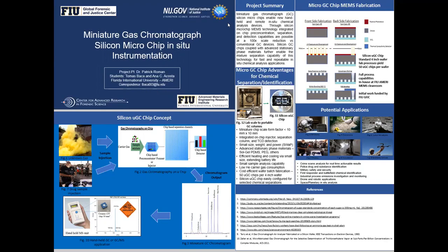We have another question from the chat. What is the mechanism of separation on the chip? So the way the chip essentially works is when you inject the gas, first of all, the carrier gas pushes the sample gas into the column, and then when inside the column, it gets absorbed by the stationary phase. When you ramp up the temperature, at different temperatures certain components of the gas will be ejected, and so you eject these components in different time intervals, so that when they get released from the column, they come out at different times and the detector can analyze them individually.